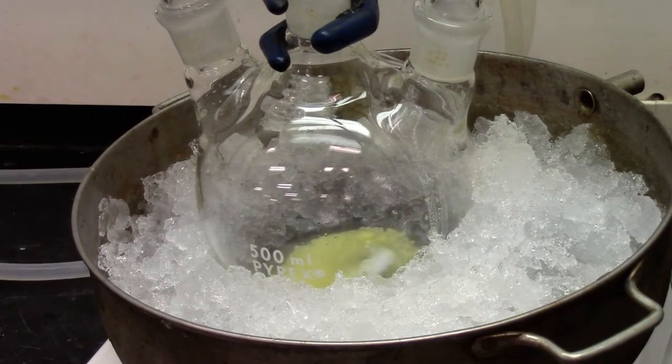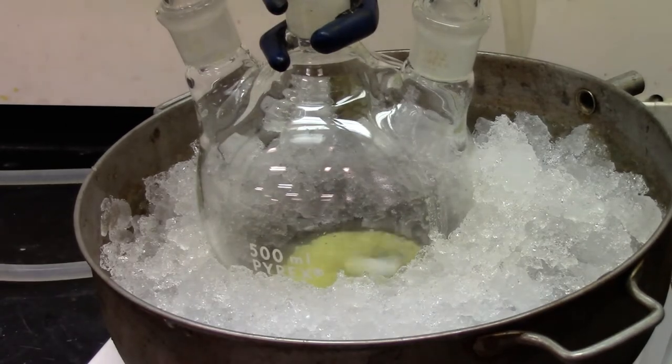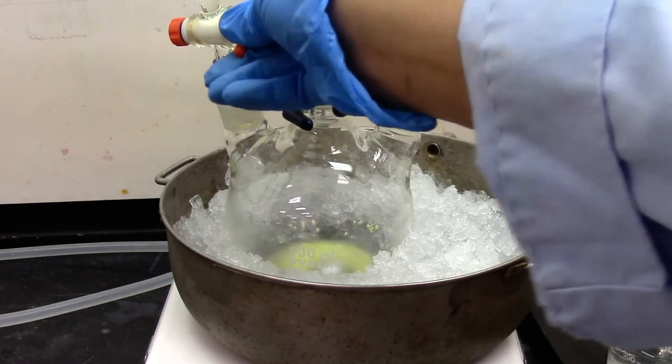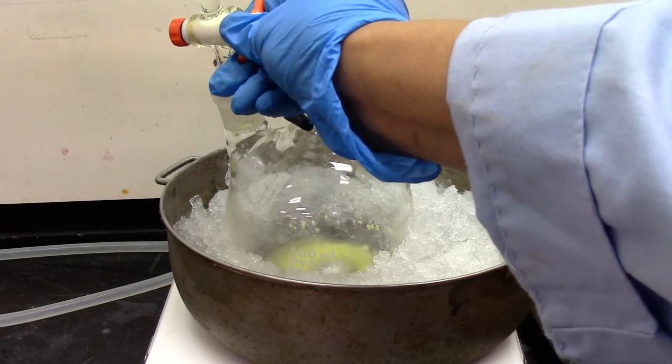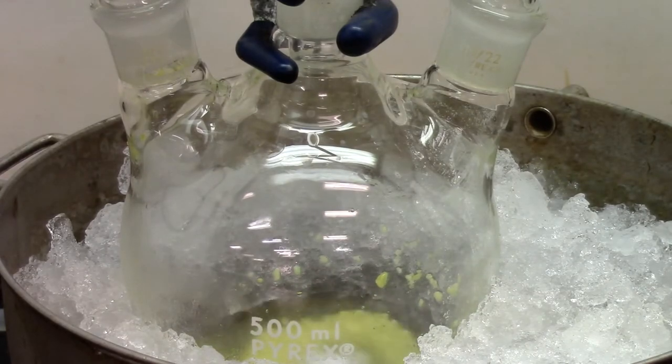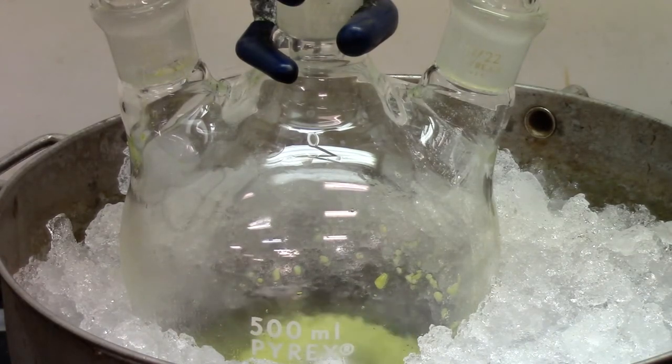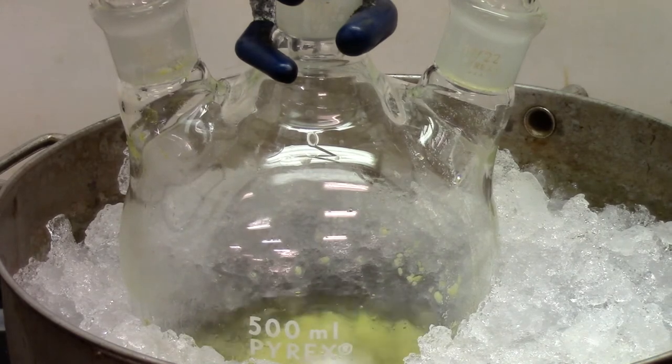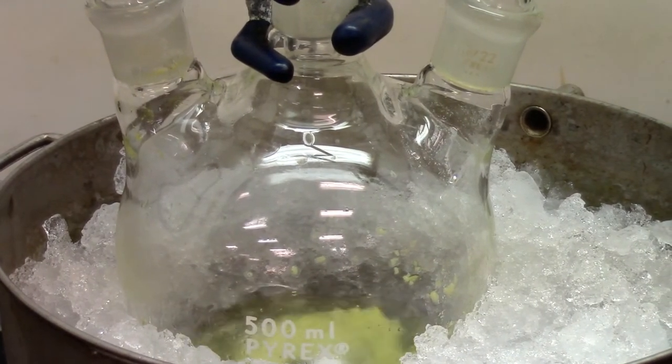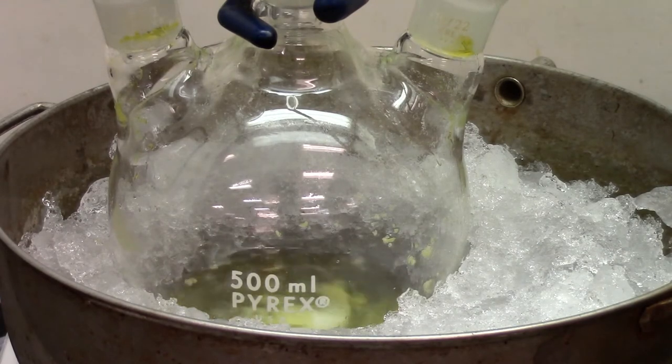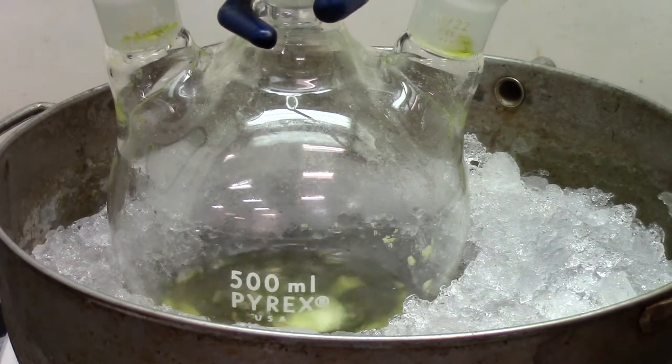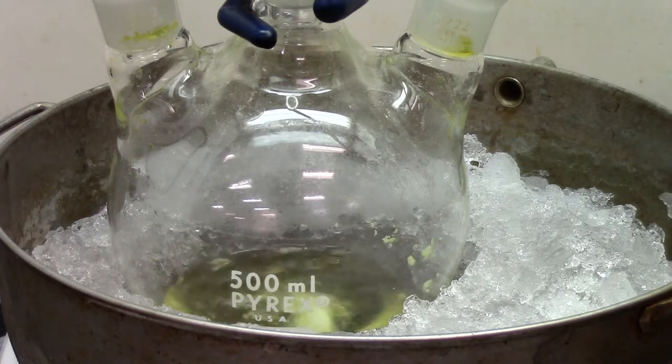And then start adding the acetyl chloride solution drop-wise through the separatory funnel. We'll go ahead and start adding the acetyl chloride mixture from the separatory funnel or the addition funnel slowly. So the addition should be drop-wise. And it should take about 15 minutes for the complete addition. The reaction is pretty exothermic. So that's the reason we need to place an ice bath to cool the reaction mixture.